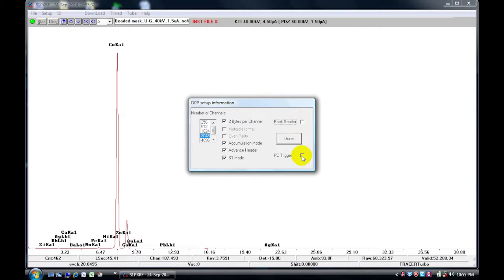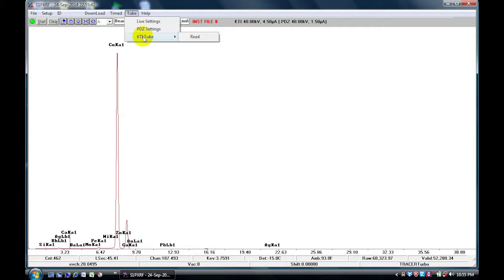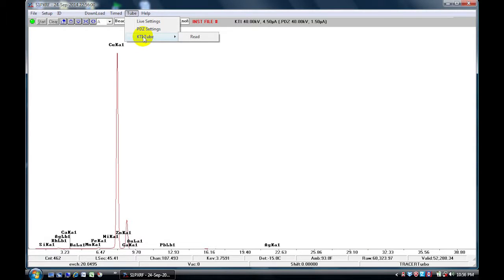When you activate the PC trigger in this window, you will notice that the KTI tube is activated, it's black. When you click on this, the instrument x-ray tube will be activated. What this means is that you need to have your instrument be positioned in an orientation that is safe for the user and everyone in the surrounding area.